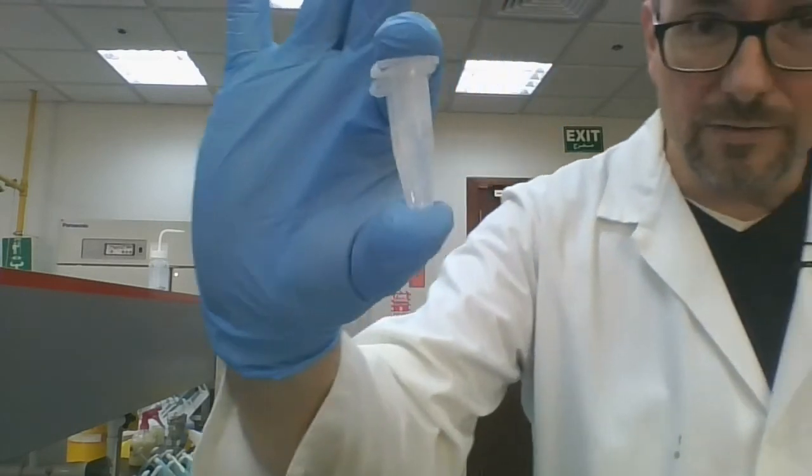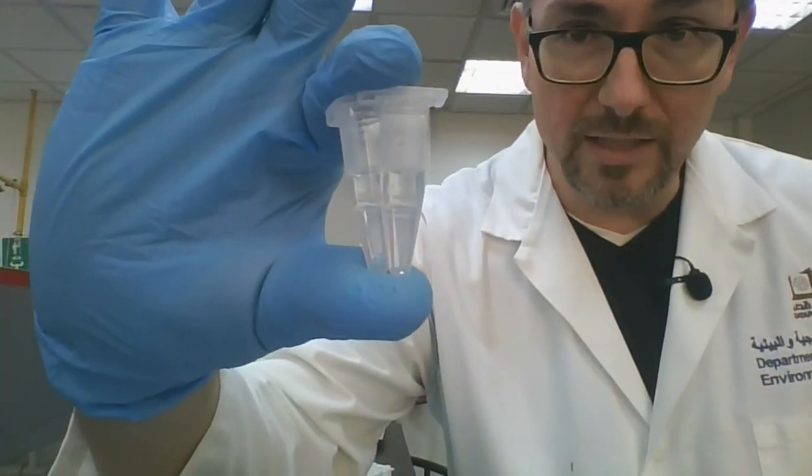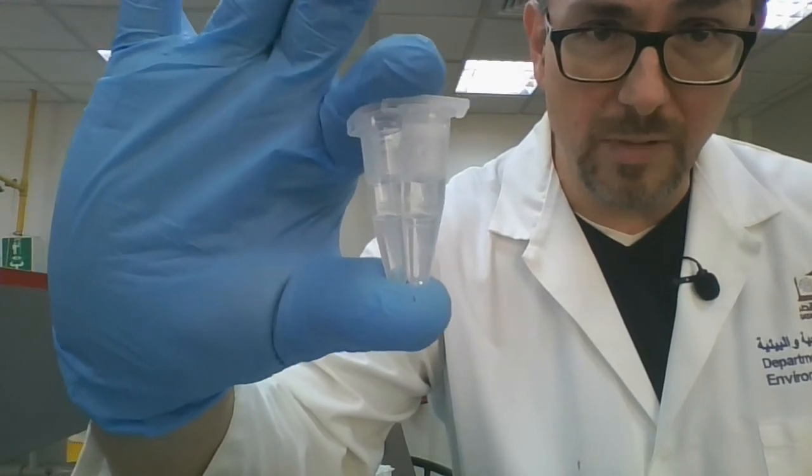And so we have two layers inside these tubes. We have the organic phase and the aqueous phase. The aqueous phase is on top, the organic phase is in the bottom. I'm going to shake these up now.